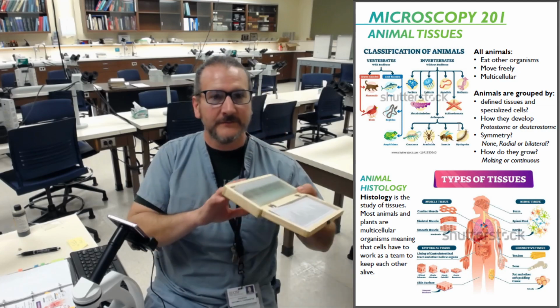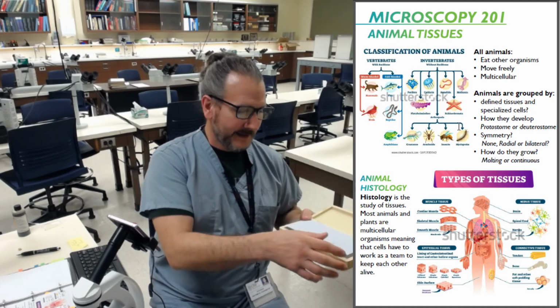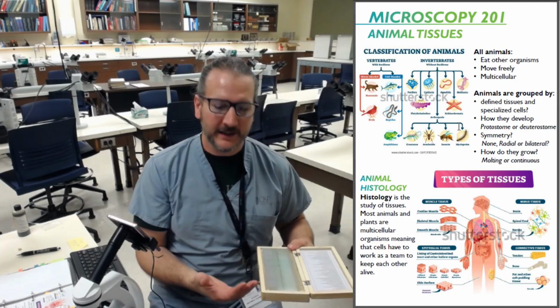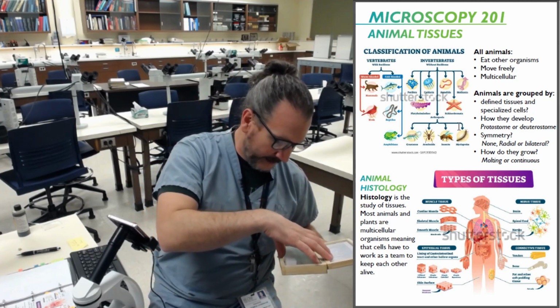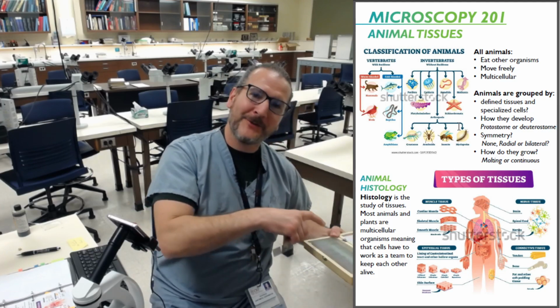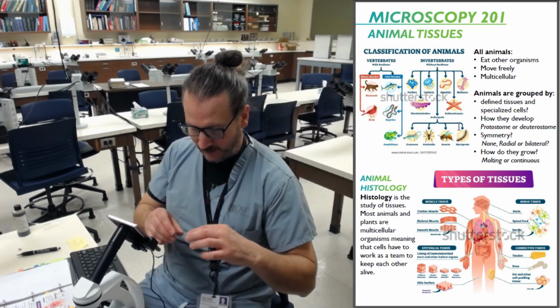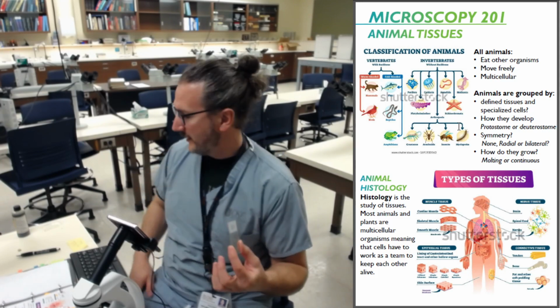Number 21. So in your case, don't forget, it says top. Open it that way. Number 21. A lot of people just think this is a liquid or a fluid, and it doesn't actually do anything as a tissue. We know that it carries nutrients. Wow, I'm getting really good at this. My numbering's off but just a little bit, but I still grab the right ones. So this fluid we think of as transporting oxygen or waste products or nutrients around your body, but it's actually a type of tissue, and it's called connective tissue.